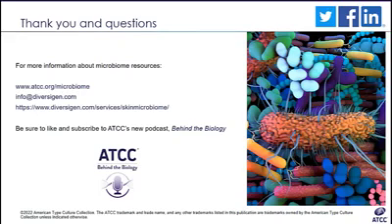Well, we've had quite a few questions come in today, so let's get back to this. Which method of DNA extraction is best for analyzing skin microbes?